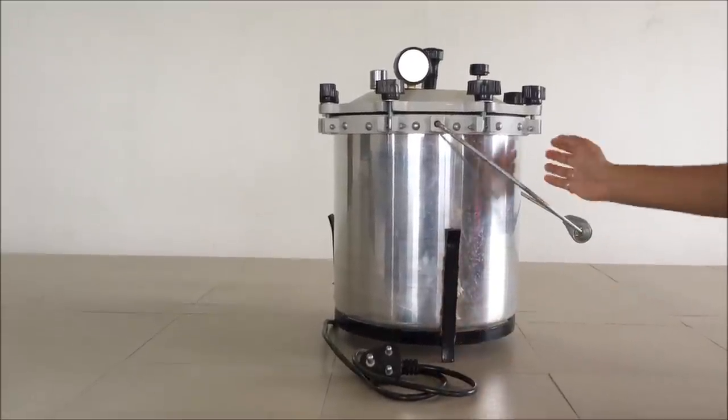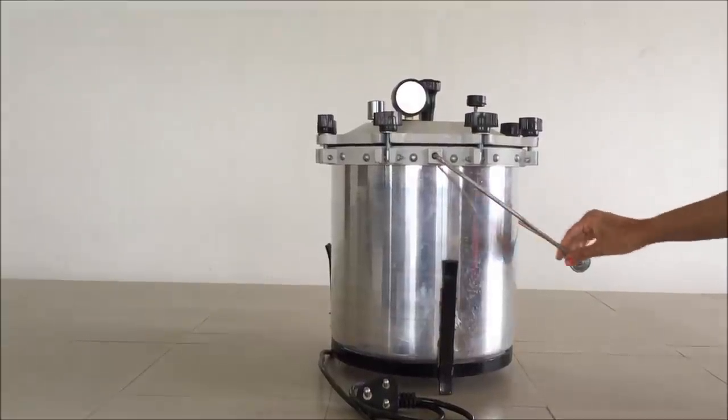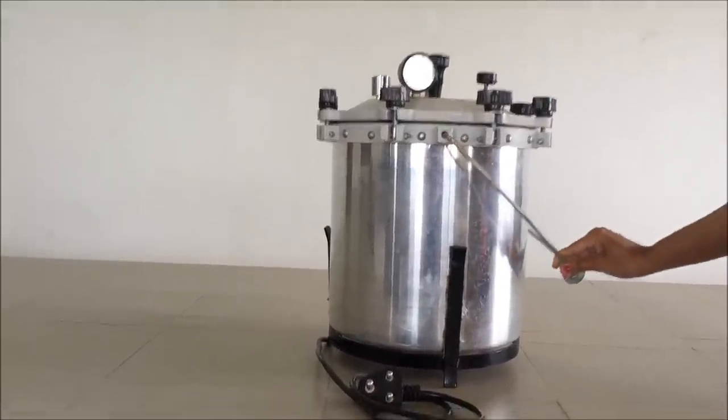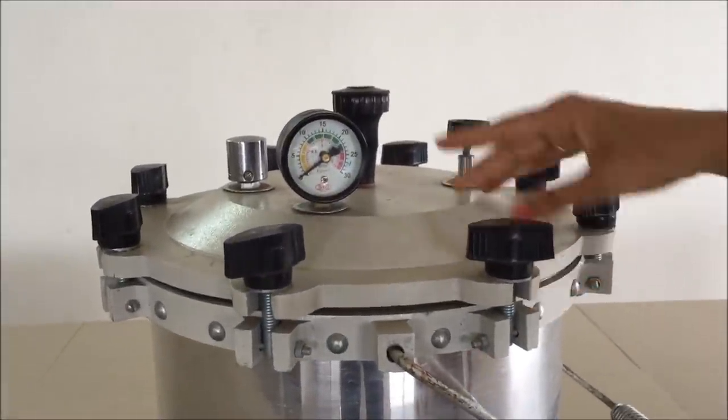It is a power cable simply used for the generation of power which converts water into a vapor. This is the handle of autoclave used for carrying one place to another place. And this is the top of autoclave.